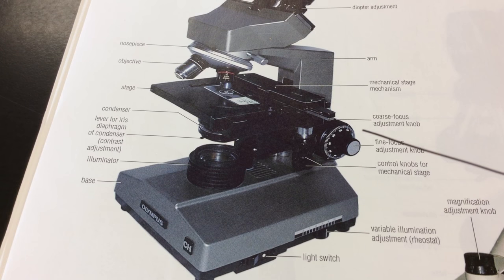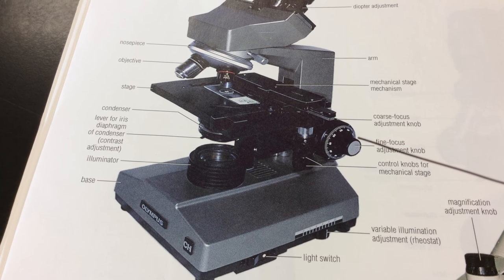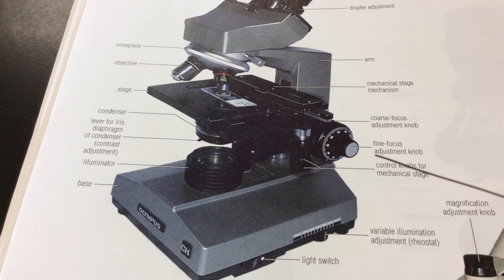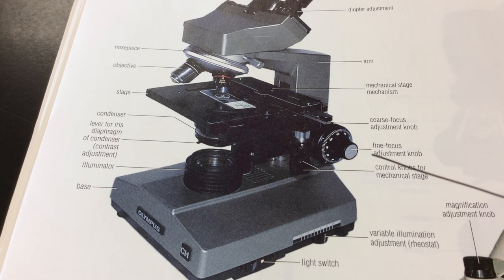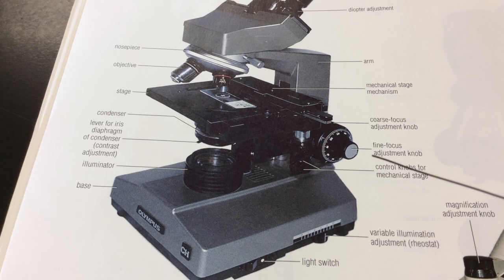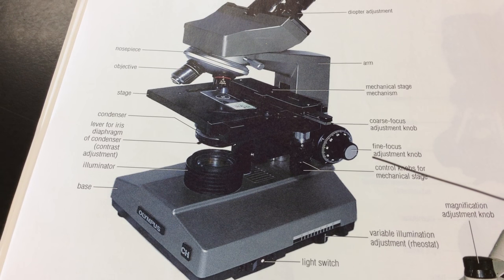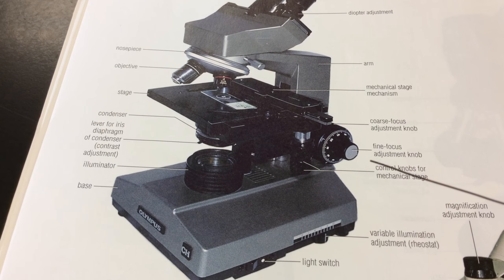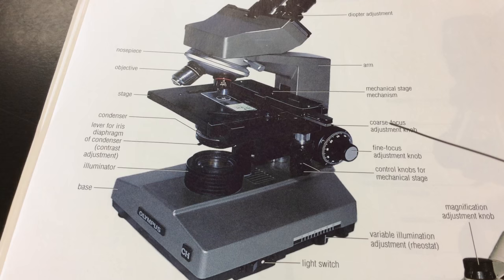We never ever use the coarse focus knob when we're using the high dry 40X lens or the oil immersion lens. When we're using the really long high dry and oil immersion lenses, we only use the fine focus adjustment knob. And you'll see that by rotating once or twice, the fine focus adjustment knob raises and lowers the stage and thus your slide in very small increments. So again, the rule is you only use fine focus adjustment knob with the high dry and the oil immersion lens. Never use coarse focus adjustment.